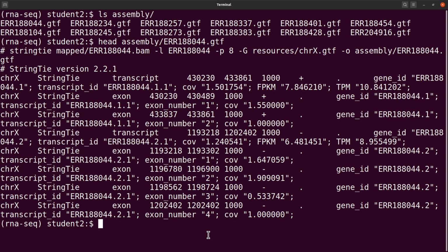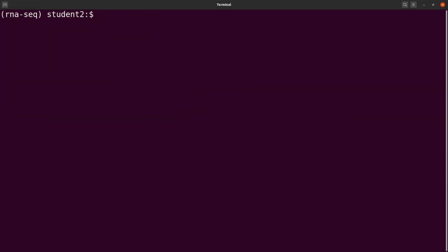It's just the extension that has been changed, because with these bioinformatics datasets, they have different formats, and that also is determined because of how we want the information to be represented. So basically, most of these files are text files. So that is what you need to know here. Now let's proceed. Let's clear the screen and continue.